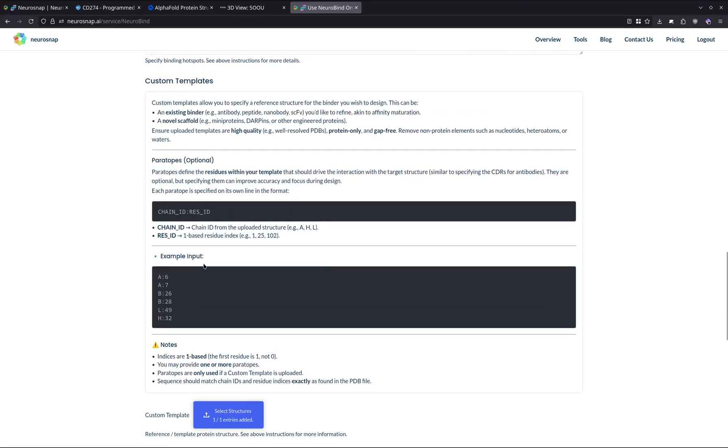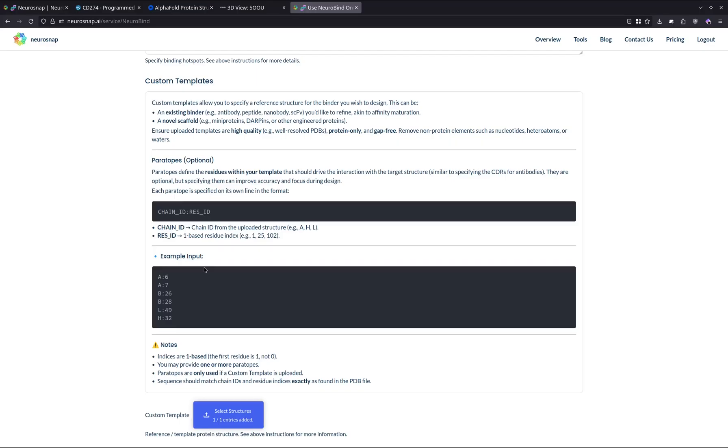Additionally, if you have an antibody or any kind of binder actually that you already know interacts with your target, you can upload it over here. And the model will automatically perform affinity maturation to try and help you get candidates or variants of your original input protein with higher developability metrics as well as greater affinity for your target.